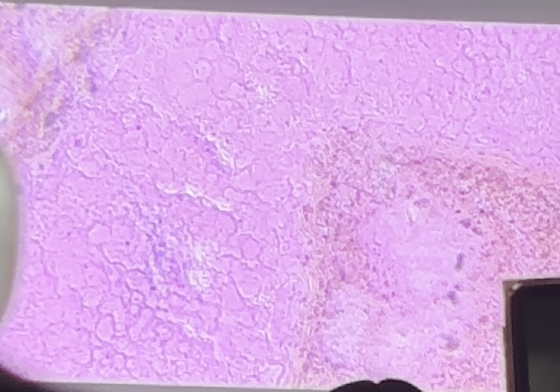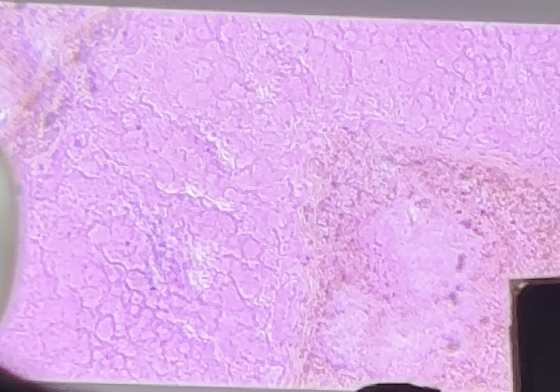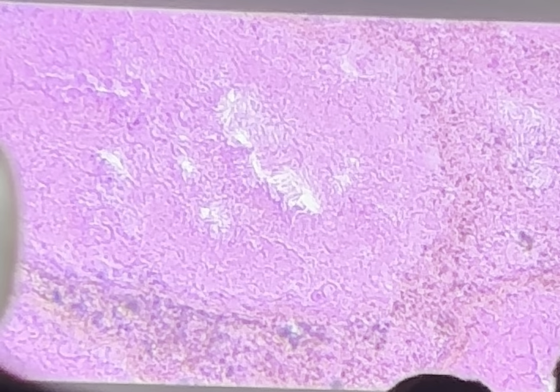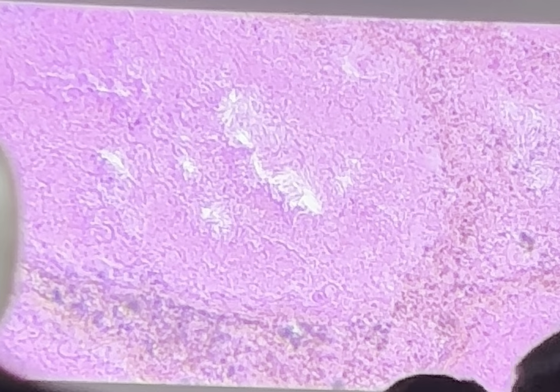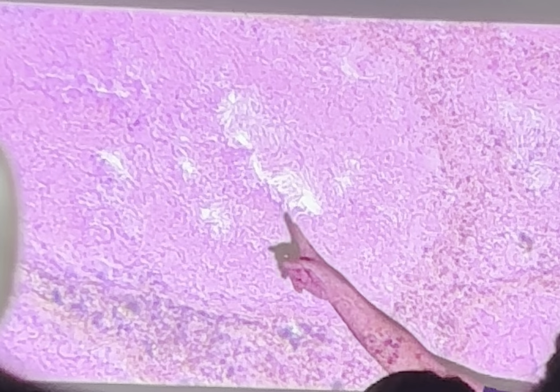So these tubular structures are actually full of red blood cells and shadowy outlines of cells that used to be there. They kind of look like ghost cells. Like you see a vague cell membrane surrounding some of these cells. So it kind of looks like a ghost because the cell died there. So what type of organ has a lot of tubules that are packed full of these cells? And even some of the cells in the center are more thin and elongated and have flagella.